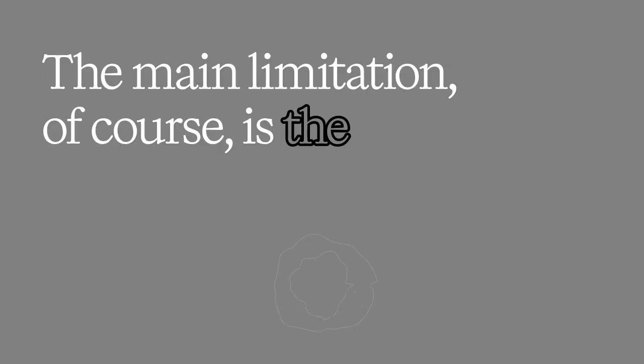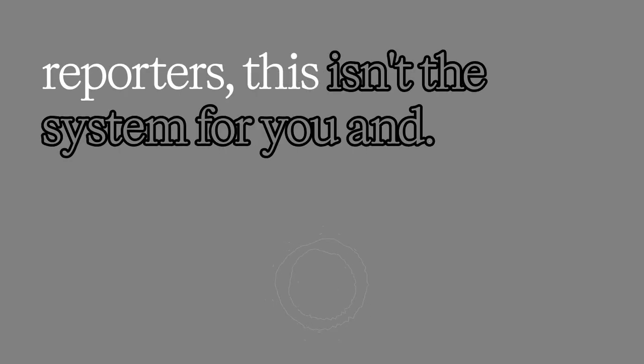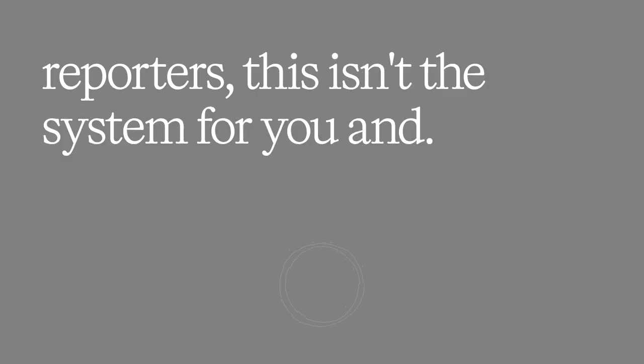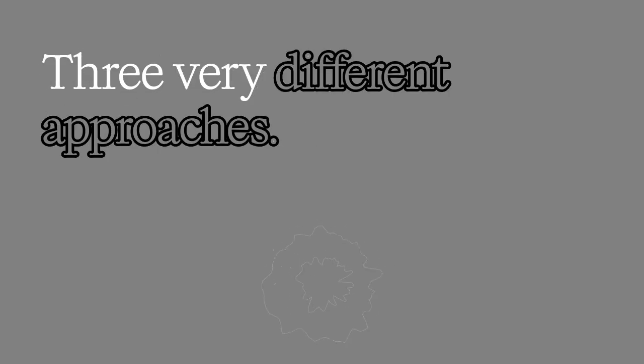Makes sense. And the main limitations? The main limitation, of course, is the complete lack of fluorescence detection. If your question relies on fluorescent reporters, this isn't the system for you. And, as mentioned, its sorting speed is considerably slower than the ICS system. Okay, three very different approaches.